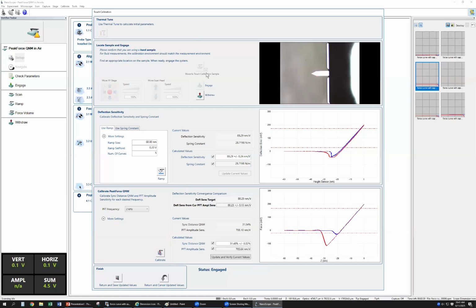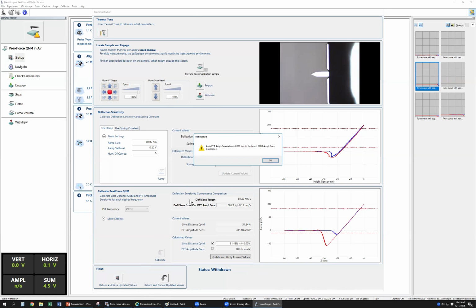Then now you can install. Okay. You can use return and save. They will withdraw automatically. Can we use this K value? Is it accurate? It's not accurate. Okay. This is not very accurate. You need to calibrate it yourself.